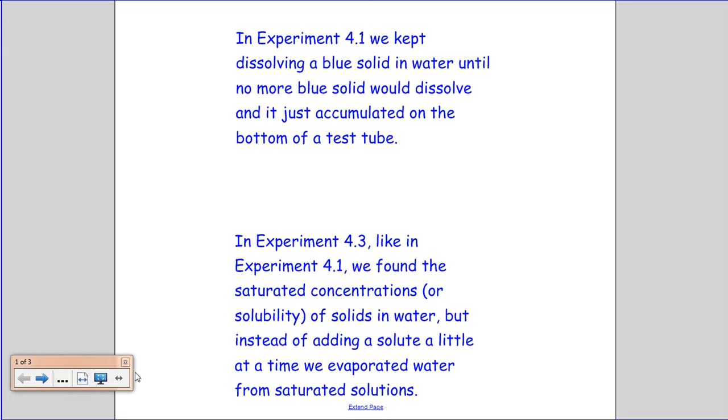Whereas in experiment 4.3, like in experiment 4.1, we found the saturated concentrations, or solubilities, of solids in water. But instead of adding a solute a little at a time, we evaporated water from saturated solutions. So experiments 4.1 and 4.3 are really two ways to do the same thing: find the saturated concentration of solutions. Now remember, the saturated concentration is the same as solubility.